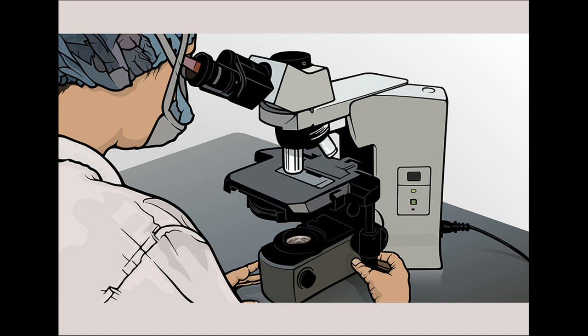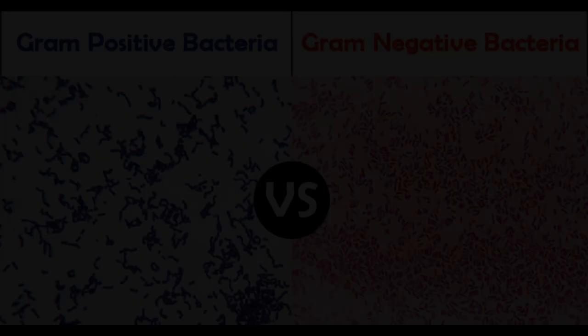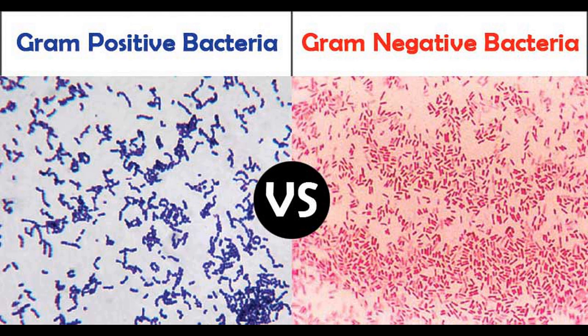After completing the staining process, we can observe the smear using a light microscope. Here you can see the microscopic view of gram positive and gram negative bacteria cultures — gram positive appears in purple color and gram negative appears in pink color.